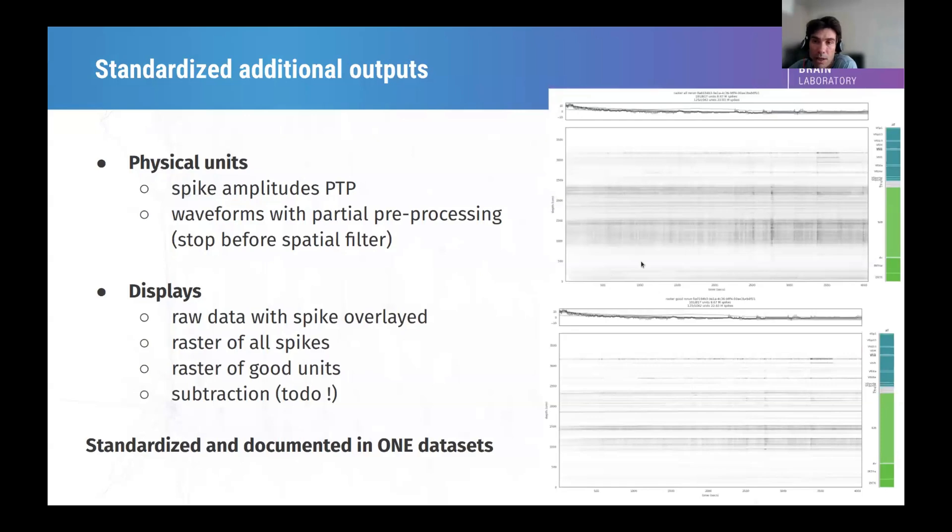Another thing is nice to output the rasters, the good unit rasters and the bad unit rasters, after so that we can have a look. As I've shown before, it's necessary, but it's not sufficient. It means that non-stationarity on the raster is not necessarily indicative of a problem with the raw data, but it's still a good practice to have a look at those rasters.